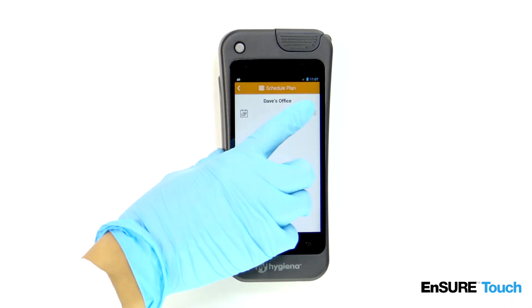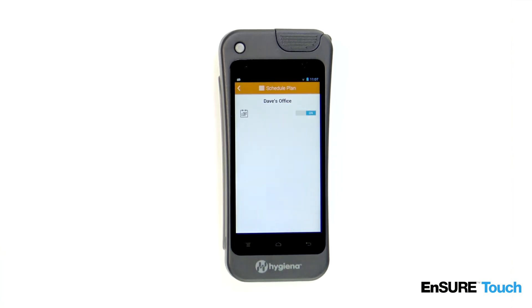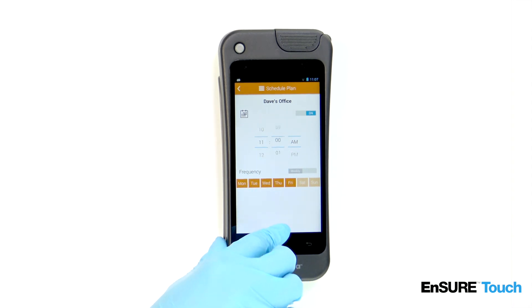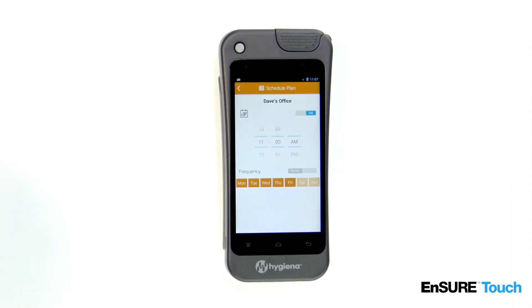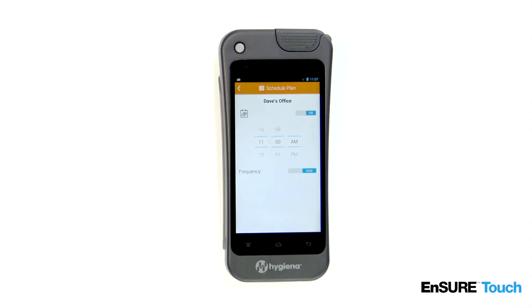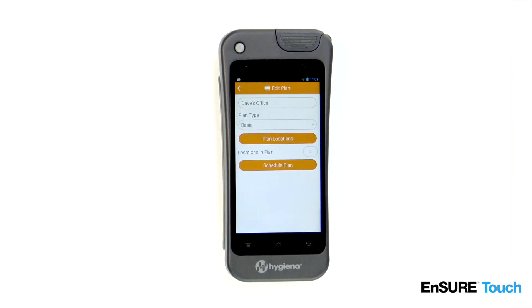From here, you can toggle plan scheduling on and off. Turn it on and then select the frequency at which you'd like to schedule the plan. Press the back button to automatically save your changes.